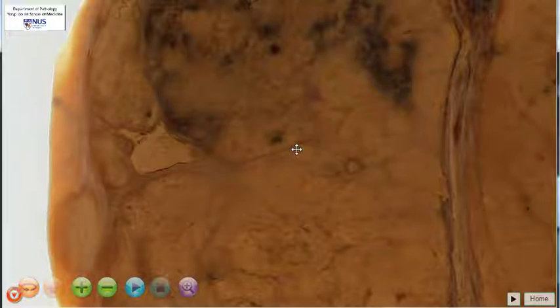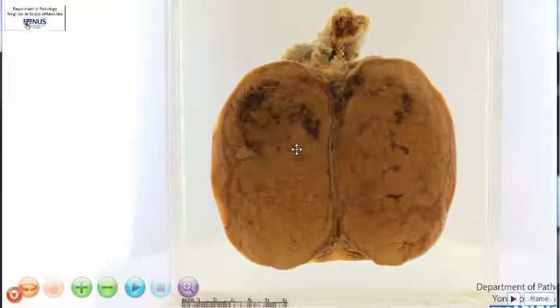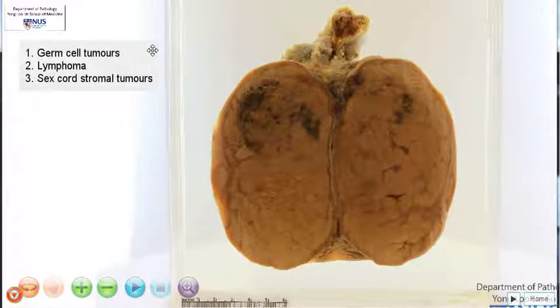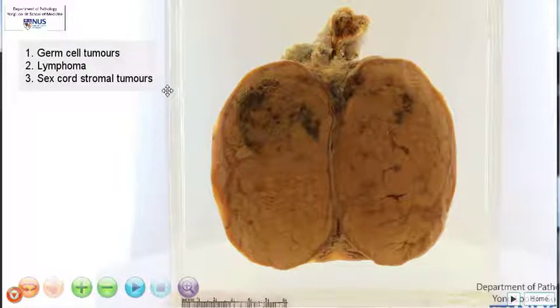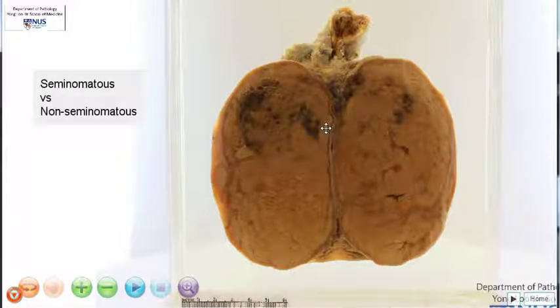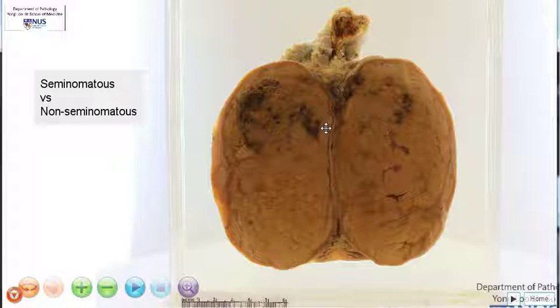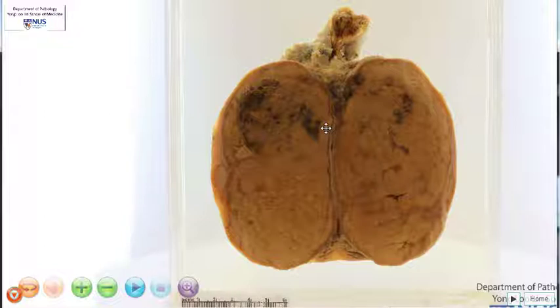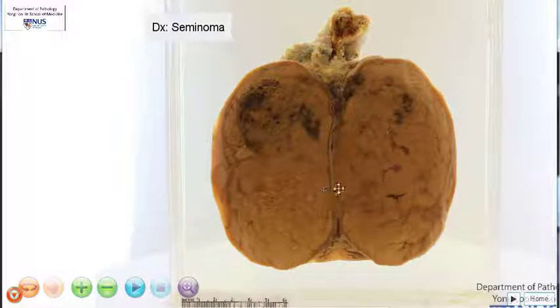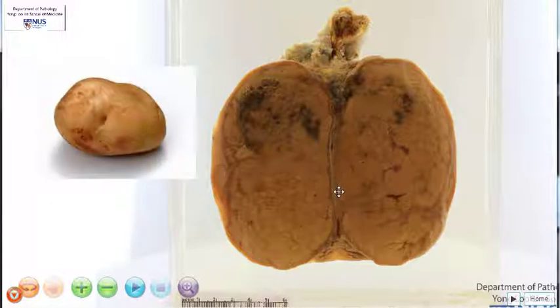So this is likely to be a malignant tumour. And in the testis, when we're thinking about tumours, we always think about germ cell tumours as a big category, versus lymphoma as another category, and sex cord stromal tumours, which are a little bit less common. For germ cell tumours, we always think of seminomas versus non-seminomas, because the seminomas are much more sensitive to treatment, for example by radiotherapy. This is a classical appearance of a testicular seminoma. It's usually very solid, very fleshy, and sometimes it is actually known as the potato tumour because it does resemble a potato.